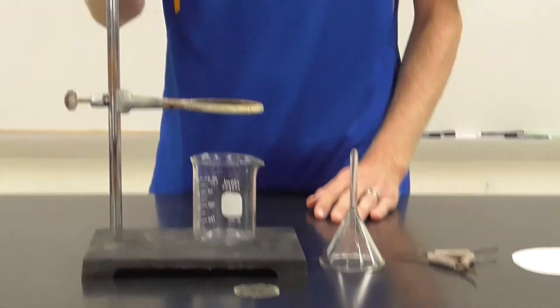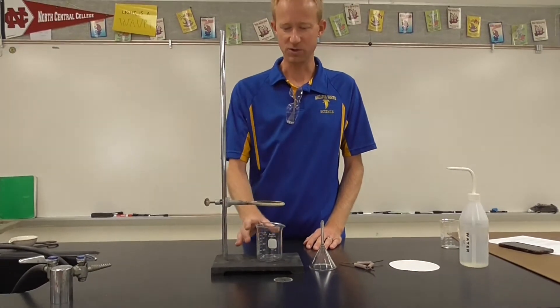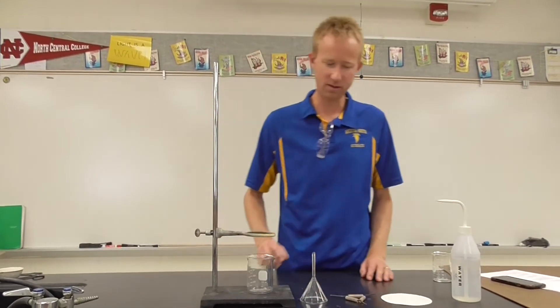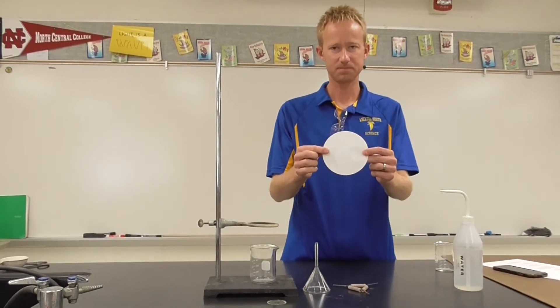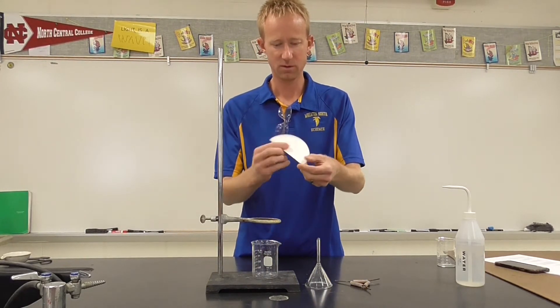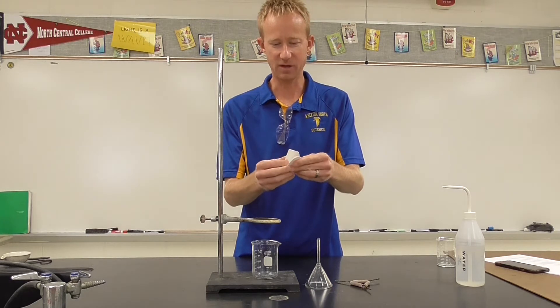You'll also need a ring with a ring stand, and a beaker that will catch your filtrate. So here's what this would look like. Take your filter paper, fold it in half, and then fold it in half again.